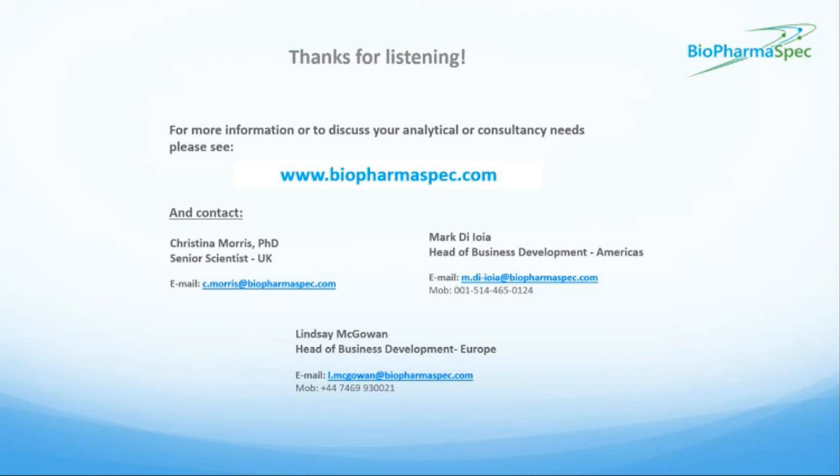Let's get started. Our first question is, up until now, the industry gold standard technique for HCP analysis is immunoassay, a high throughput and sensitive ELISA. You are advocating the use of mass spectrometry. Can you briefly summarize the pros and cons of each approach?